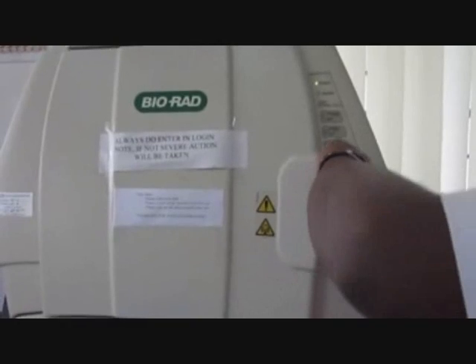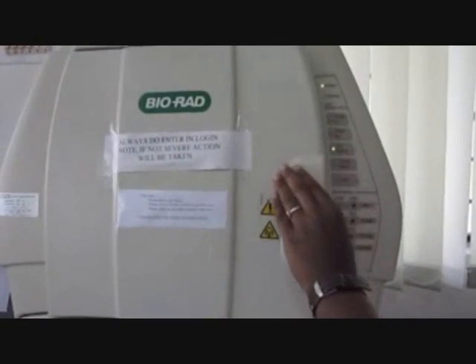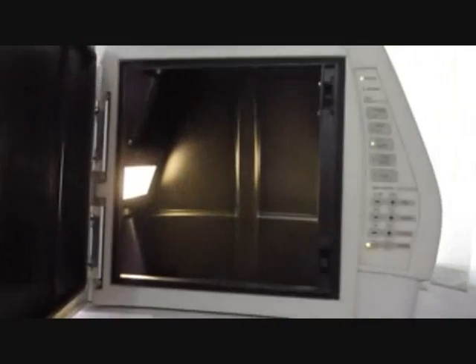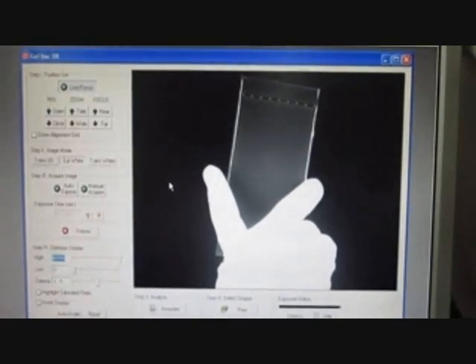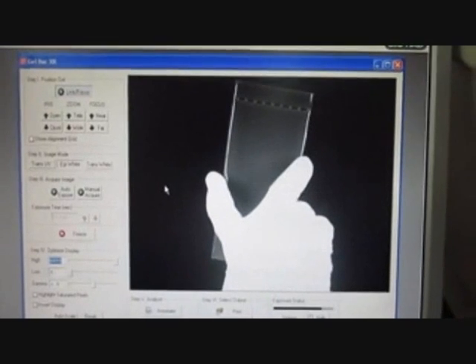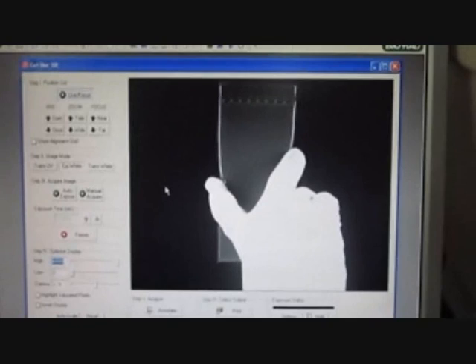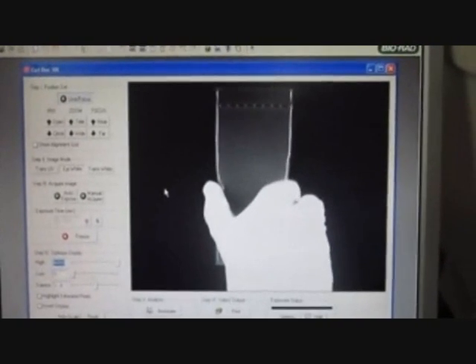If the position of the gel on the stage is not proper, this can be adjusted by opening the upper door on the imager. The gel can be moved to appropriate position on the stage by hand. Make sure that the trans UV light is not switched on when you place your hand inside the imager.